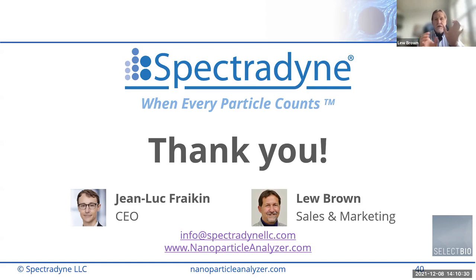And that's going to make a huge difference, particularly when you talk about bioavailability and the clearance rates and things like that. Where in the body can these particles travel to? The size is really important. So one of those samples, because it's got smaller particles, might end up in a different place or concentrating on a different place in the body than the other one because of that size difference. So as Jean-Luc said, it's truly the overall distribution that is important here, and being able to compare the shape of the distributions is very valuable.